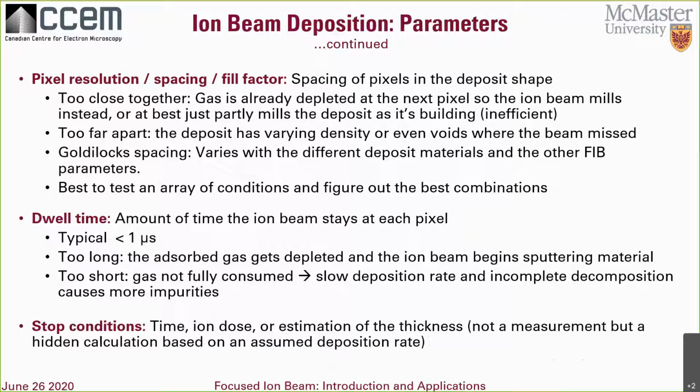There are ways using gas-assisted etching, if you really need a very high aspect ratio, with gases like xenon difluoride. Using those, you can get deeper. But anyway, just test it first. I would say that's probably the best bet when doing something like patterning: go to an area you don't care about and do a little test there, see how much you can get away with, and then transfer what you've learned to the good area.